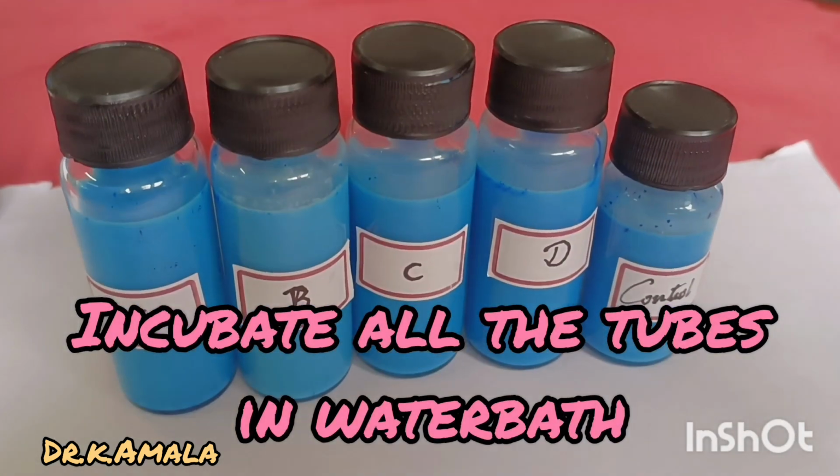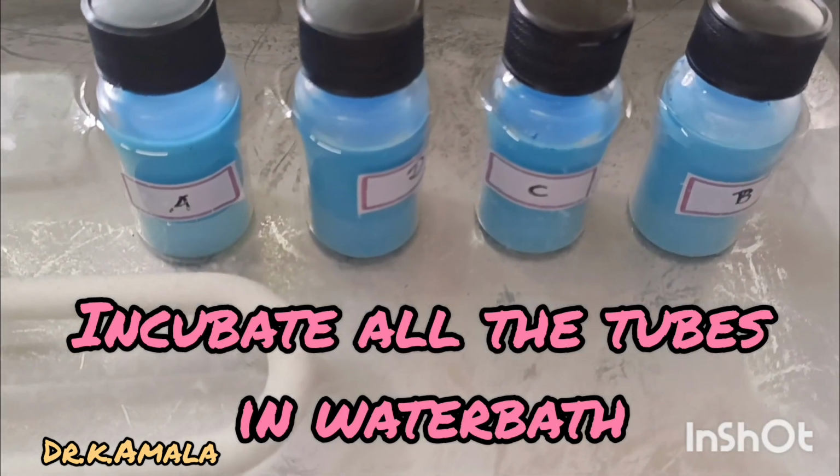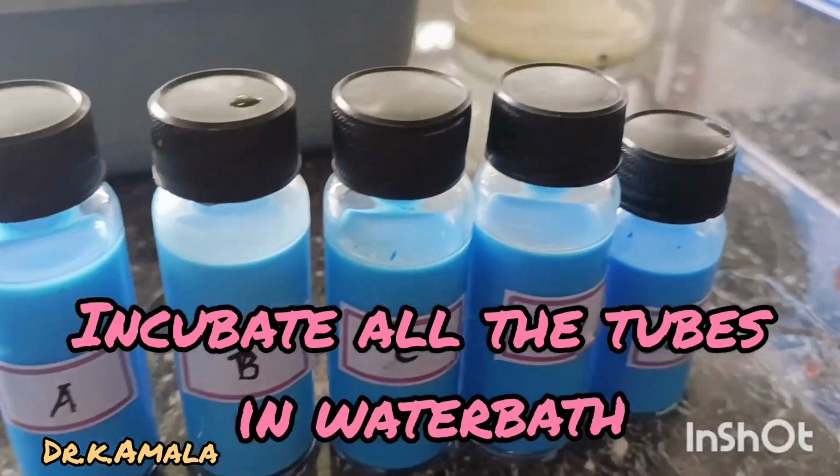And incubate all the tubes at 37 degrees Celsius or 98.6 degrees Fahrenheit for 30 minutes, or incubate all the tubes in a water bath.